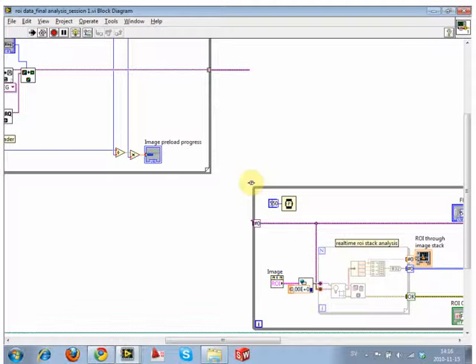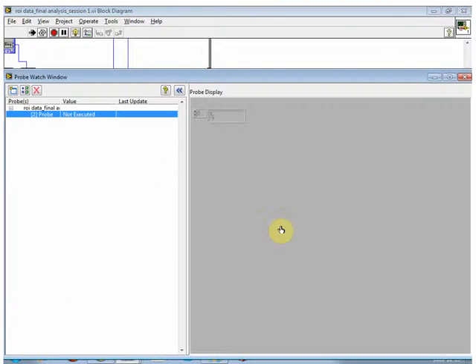If you watch where these lines are running, it's shooting across. So you can say, I want to probe what that data is, tell me what's in this data stream. When it runs, it'll change from not executed to executed, and there's nothing in here. These should be images, and there's nothing. So we know that something's gone wrong with telling it where things are, because this is not right. So we've got a problem here.